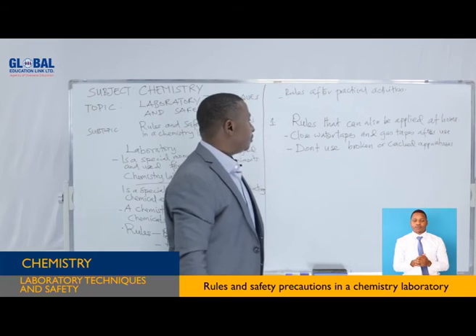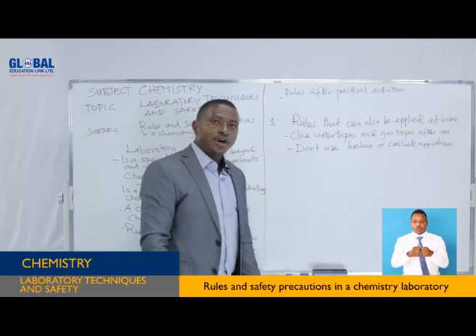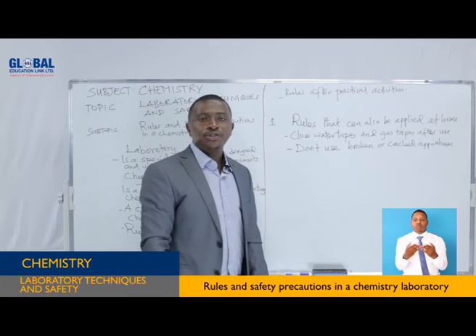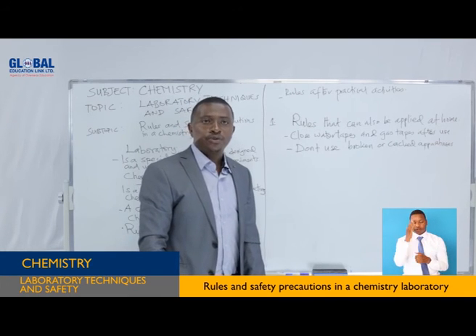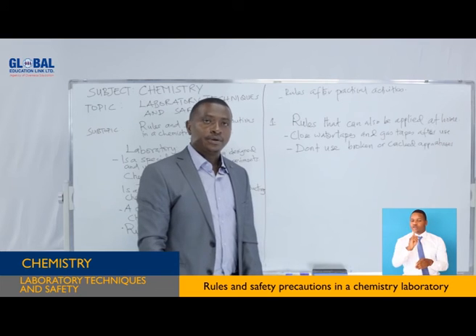Rule number 2, don't use broken or cracked apparatuses. You also have glass-made utensils at your home, so you should not use broken or cracked apparatus, because a cracked one can break and a broken one can cut you.